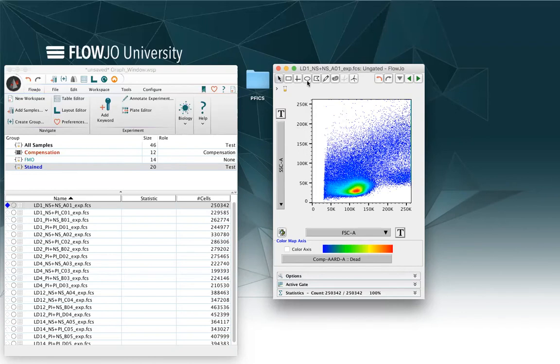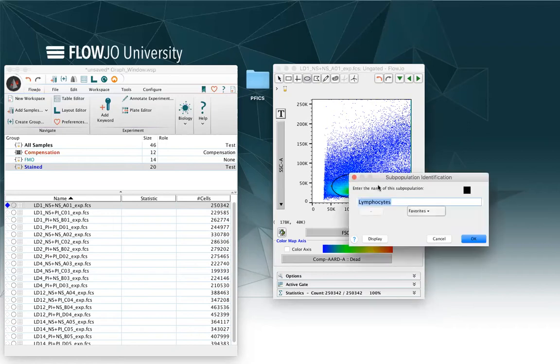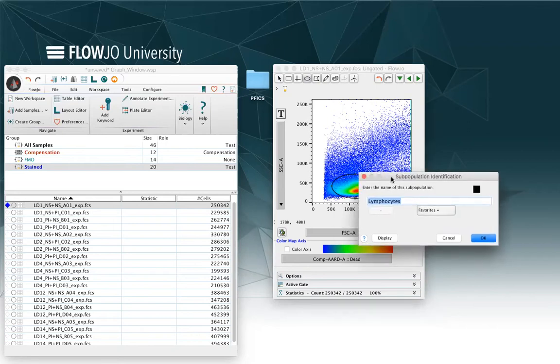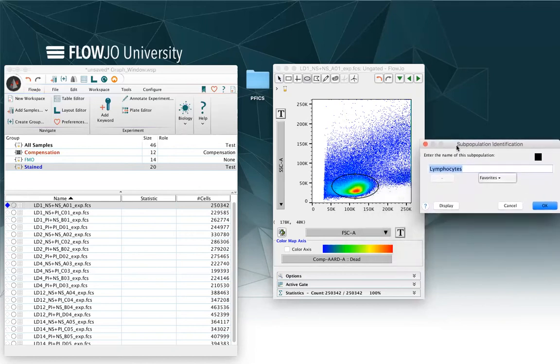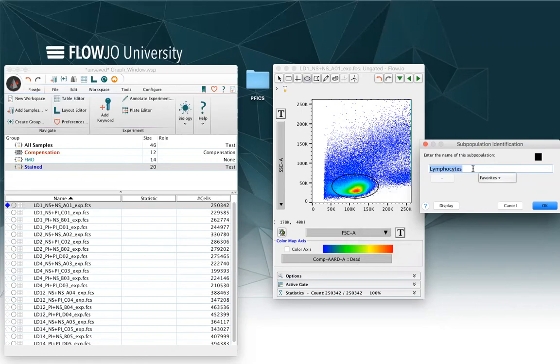I will just start performing my gate by starting from an elliptic gate. So I can click on it and draw my gate. And whenever I have a side scatter versus forward scatter parameter, the suggestion from FlowJo will be lymphocytes. If the name of the gate is correct, you can click on OK.